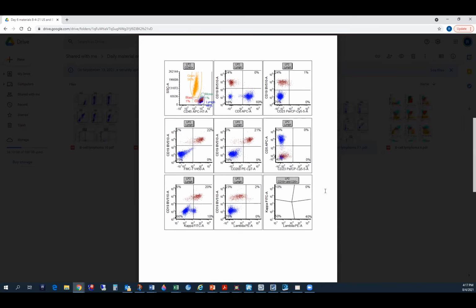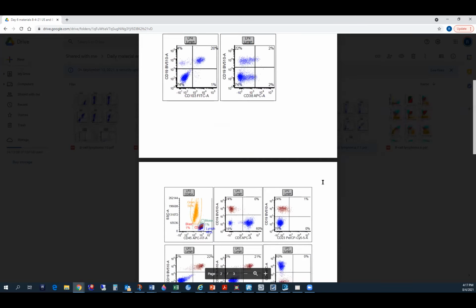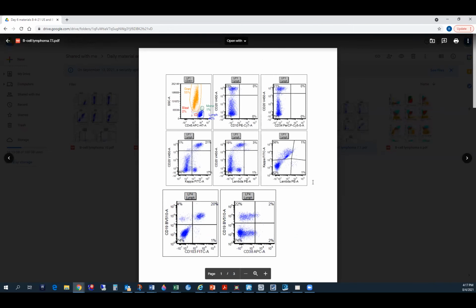That's most interesting in these plots. And in the last plot, we can see the side scatter increase is a little more prominent in the CD45 versus side scatter. There are CD103 positive, CD11c positive, CD25 positive, and dim CD123. So that's why I was thinking this was a hairy cell. Yeah, this is a hairy cell. And you mentioned that there is a trail in CD20. I appreciate you recognizing that.